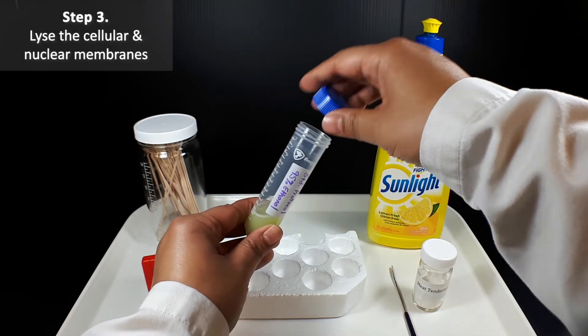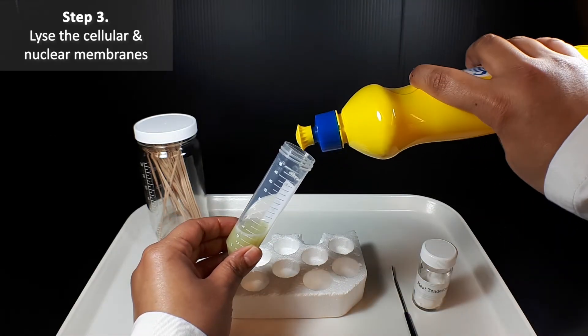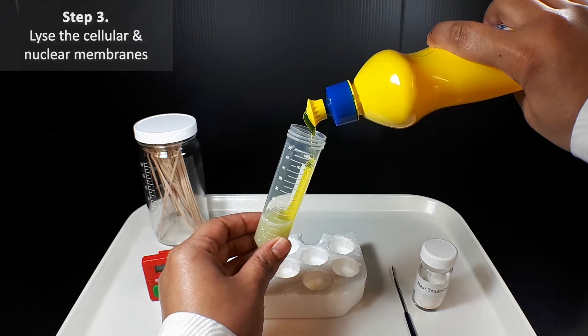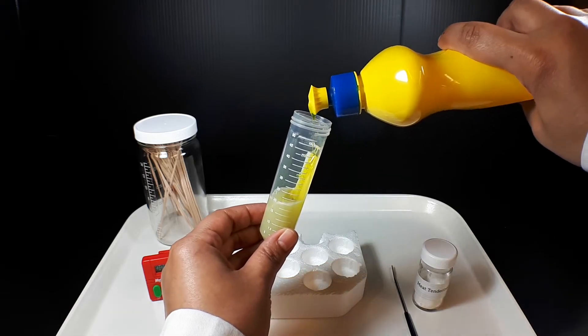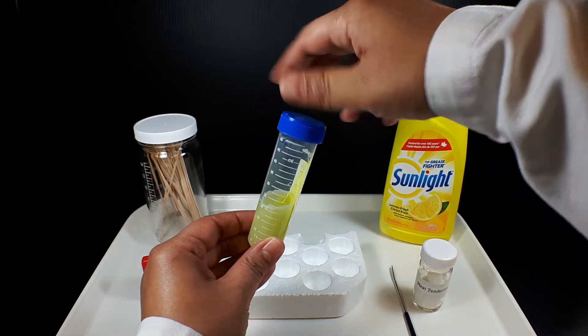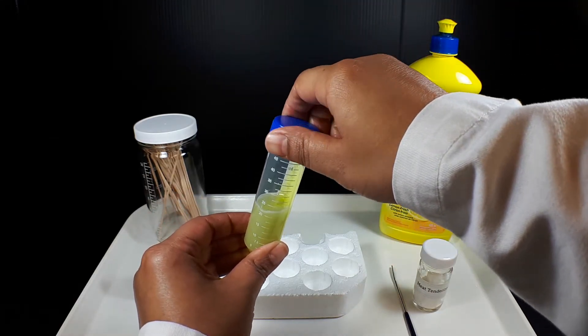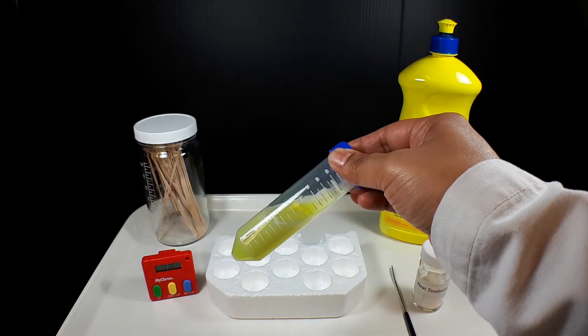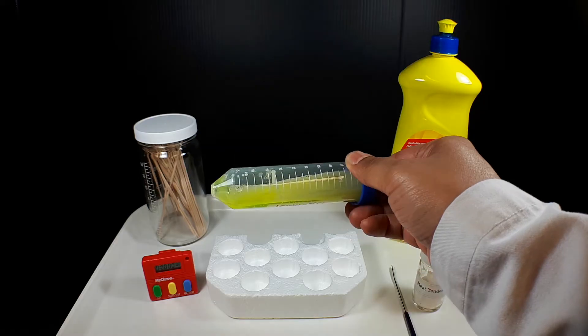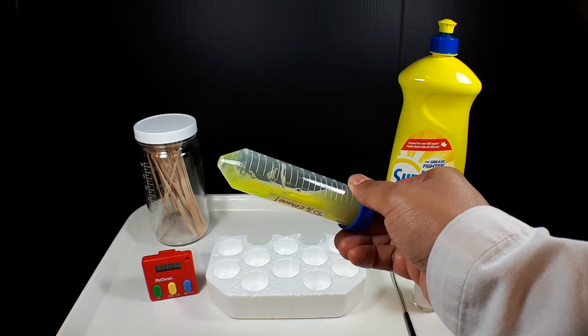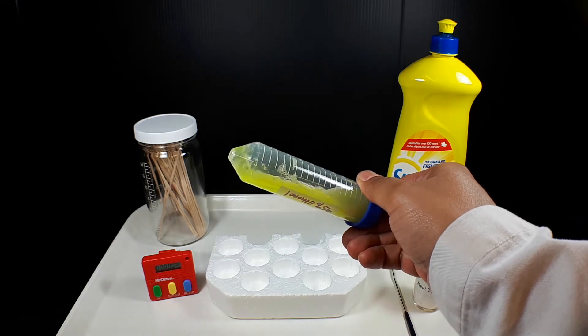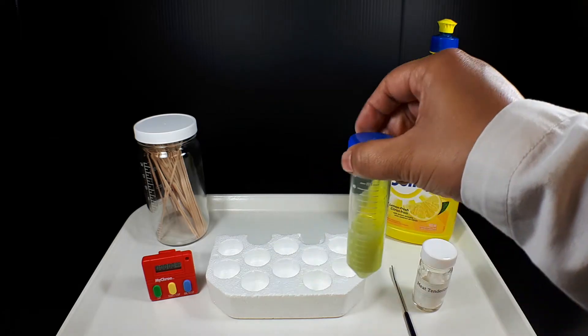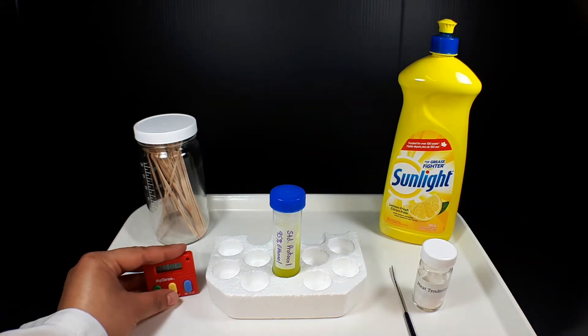While the blending step broke down the hard plant cell walls, we still need to lyse the cellular and nuclear membranes to fully release the DNA. This is done by adding 5 milliliters of dish soap. Now tightly close the tube and gently rock it back and forth 5 times to mix. When finished mixing, return the tube to the rack and leave it for 10 minutes.